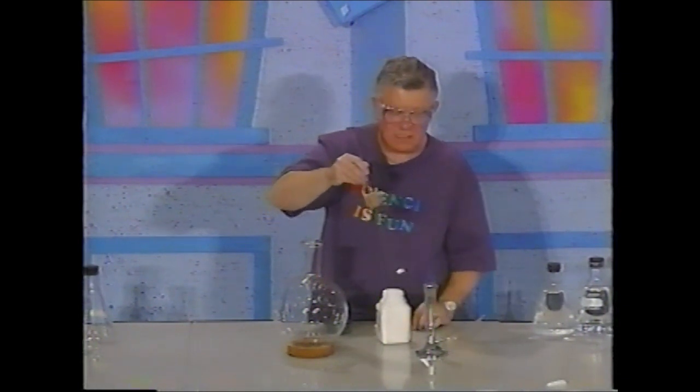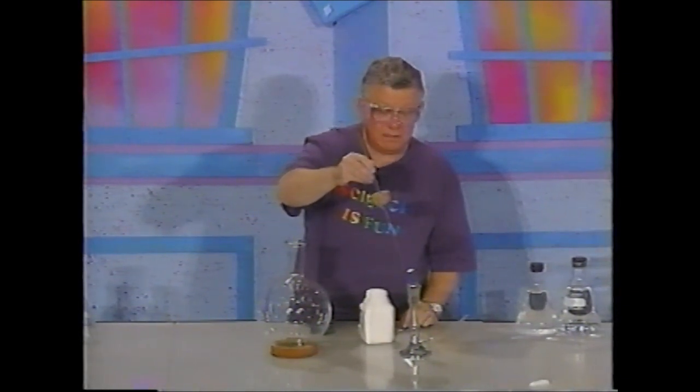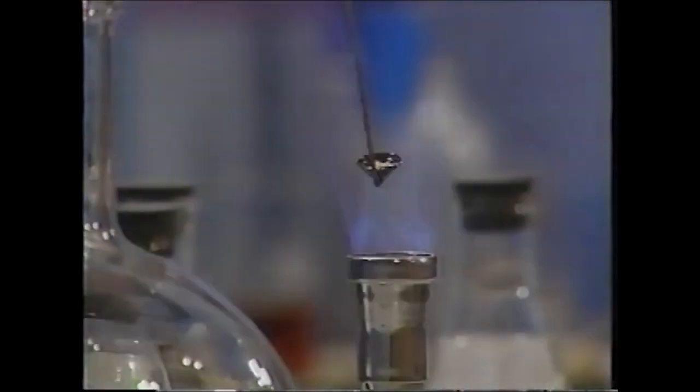And then I'm going to stick the sulfur in the flame, and the sulfur melts and begins to burn. If you turn the lights down, please, you'll begin to see a flame coming from the combustion of the sulfur. And it's a luminescent flame, of course, very pretty blue. But if I put it into this flask, it has oxygen in it.